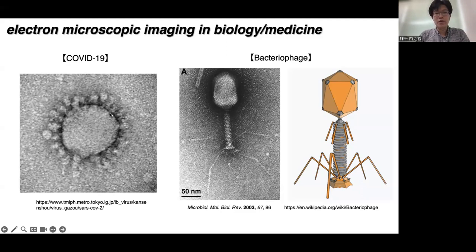Okay, you may also find the image of bacteriophage in your textbook. So this is like an alien and a bit difficult to believe this structure when we don't see the structure directly. However, the researchers directly observe this structure by electron microscopic imaging. So you can now understand how important the understanding of the small world is.